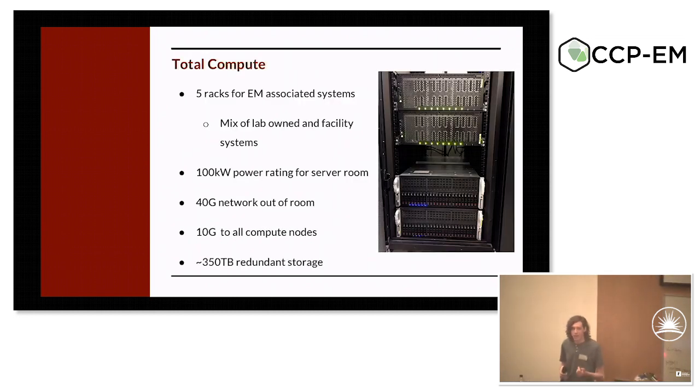So for that, we have a fairly large dedicated setup in computational hardware in order to make this go as smoothly as possible. We're not a national facility, we're not resourced in the same way that eBIC and Diamond are for this, but for the user base that we have, we have a fairly decent setup for our computational needs. And this is expanding all the time, so we're not even a third provisioned at the moment in terms of our overall budget and space.